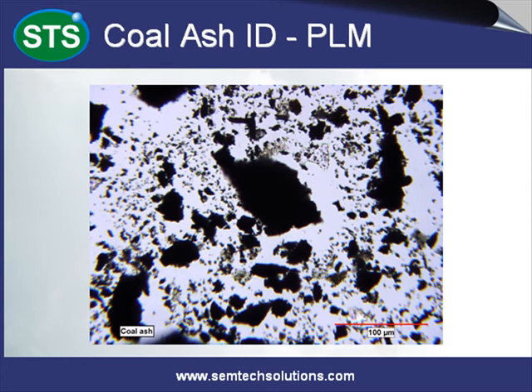PLM observation of coal ash displays opaque gray-black particles that often show curved edges and some air pockets. Coal ash does not dissolve in the refractive index oil.